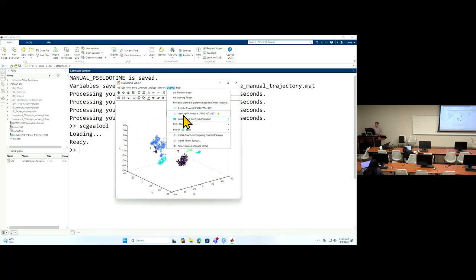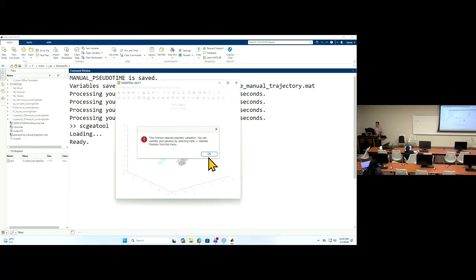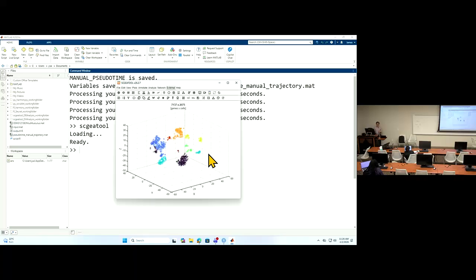You see, this is not accessible for you for the gene agent analysis, for the reason I just told you: it's very computationally heavy, and I don't want to create unnecessary working load, so I restrict this.